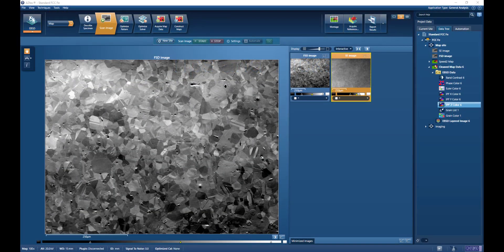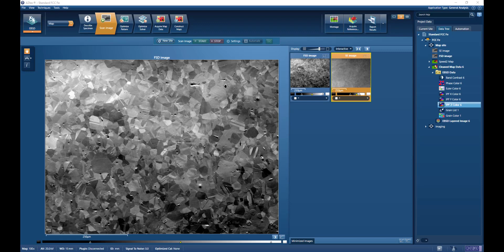We're starting within Aztec, and we're showing a force cutter image of a recrystallized austenitic stainless steel. The first consideration that we need to think about is the measurement step size required to resolve adequately the grains in our sample.